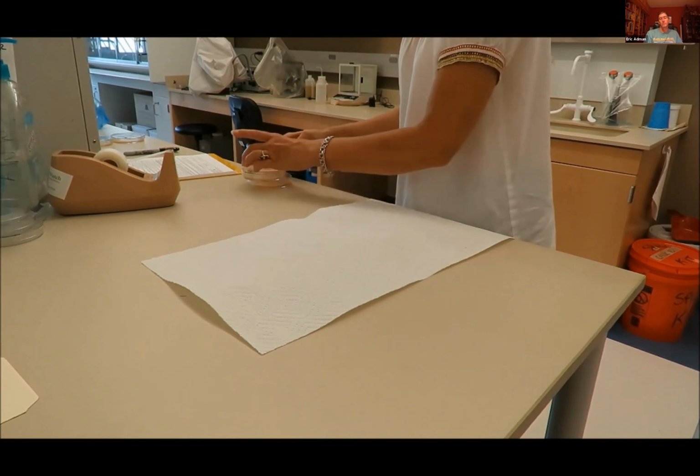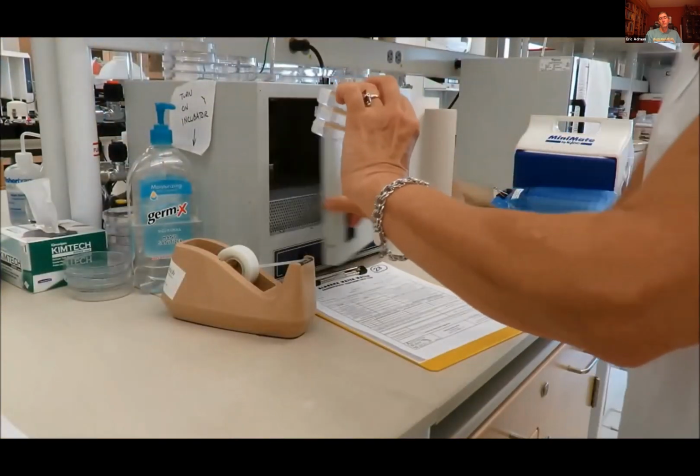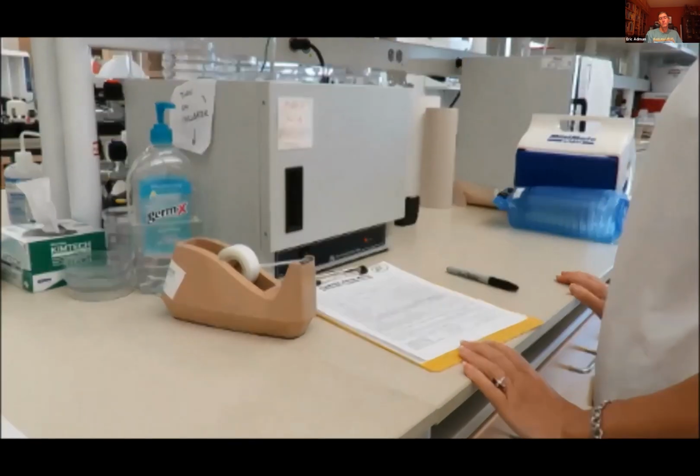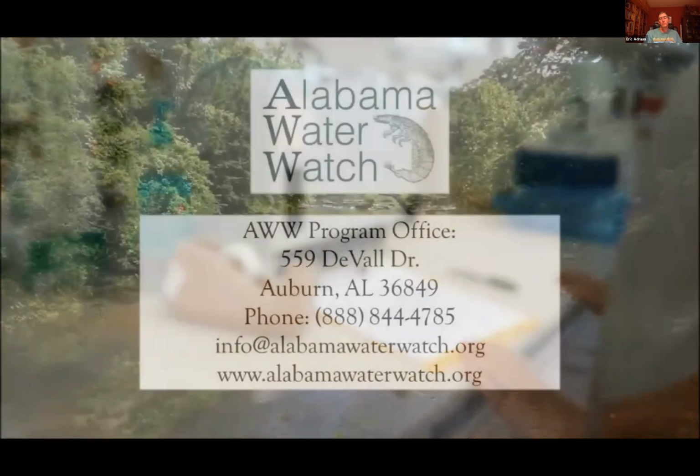To prevent condensation from dripping onto the plates from the lids, turn the plates over and place them in the incubator. Incubate plates between 29 and 37 degrees Celsius for 30 to 48 hours.